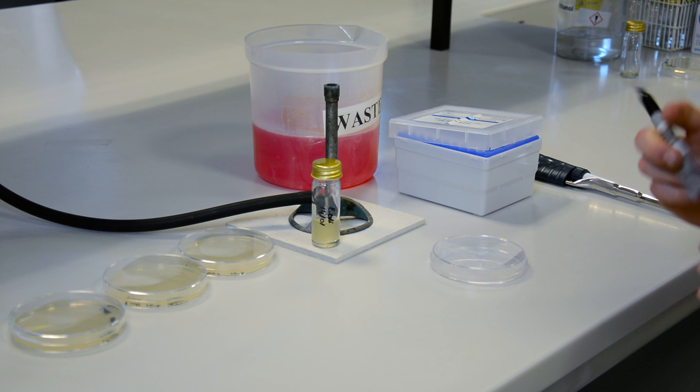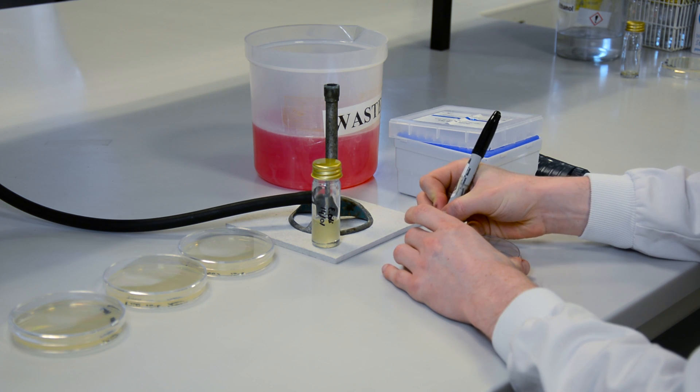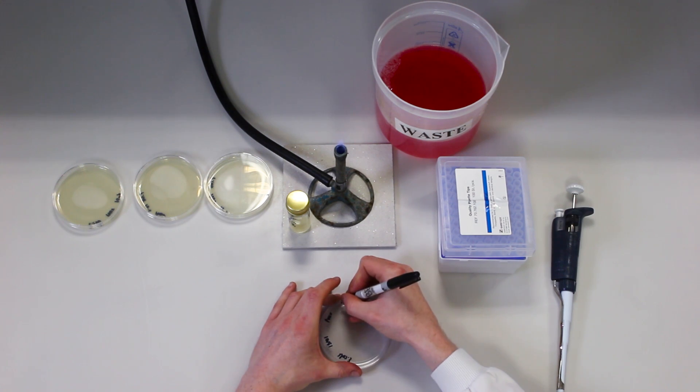This time molten agar is used and the sample to be examined may also have been prepared by serial dilution. The agar should be kept molten at around 50 degrees Celsius in an incubator or water bath. Label the base of your empty Petri dishes with all the relevant details described previously before you start.